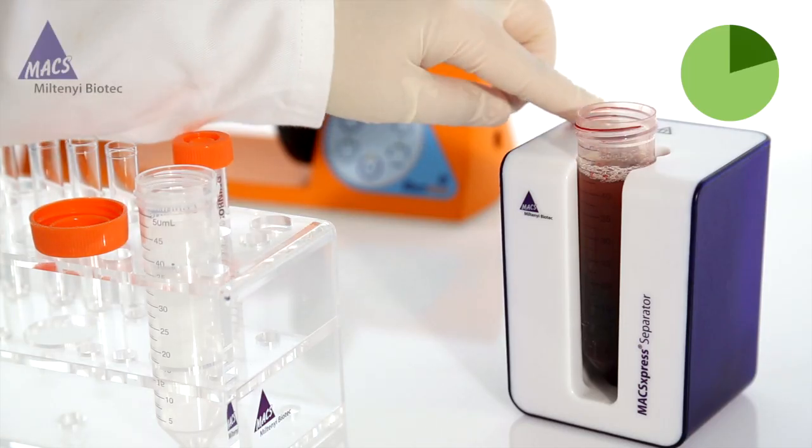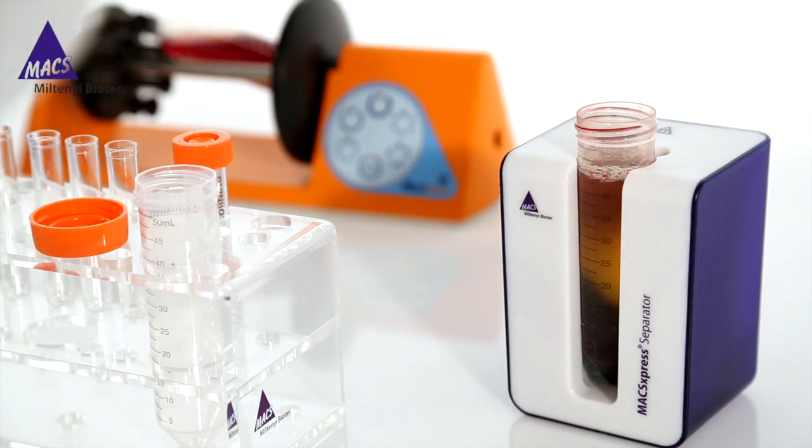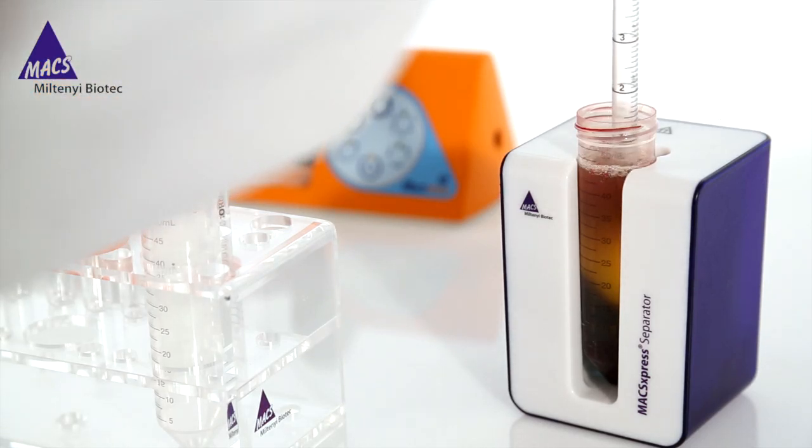You can now easily collect the pure target cells from the tube. The cells are immediately ready for any downstream application.